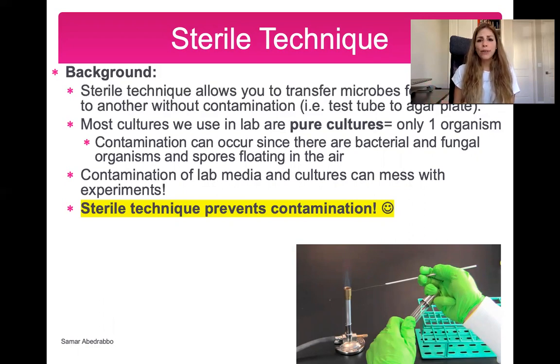And so if you think about it, maybe you have someone that has a sore throat, and you take a sample from their throat and you want to culture it, meaning you want to grow the potential bacteria that they have an infection with. You want to make sure that you're not getting any other bacteria. And that's exactly what sterile technique is.